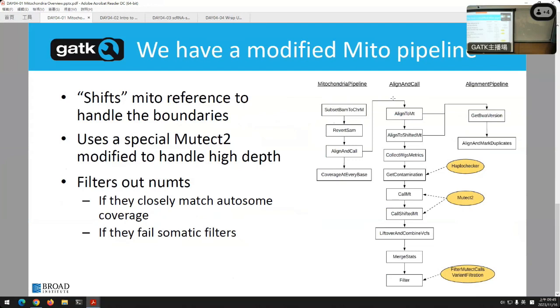Simple enough. The problem is that has nothing to do with nature. And even when you're reading it, your reads don't care that we start numbering at a certain point. Wherever we make that cut, we start having big alignment issues there. We have reads that will cross that boundary because as you're reading around, it just keeps going, right? So on those edges, we have massive errors. I mean, they can downright blow up some of the aligners.